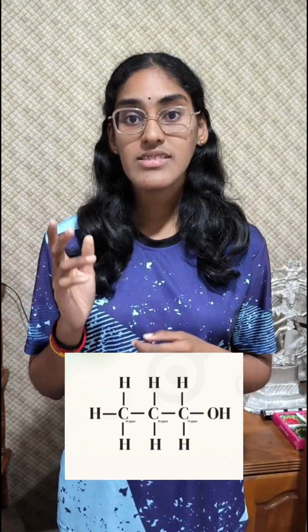So let's conclude now. As you can see, this is the structure of the unknown compound. In conclusion, we know the molecular weight of the compound is 60. When we calculate the carbon, hydrogen and oxygen present in this compound, we get a molecular weight of 60 grams per mole. And second is the FTIR analysis.